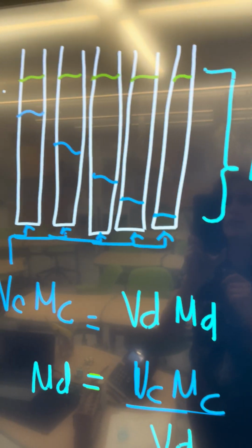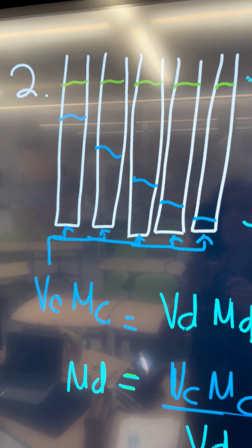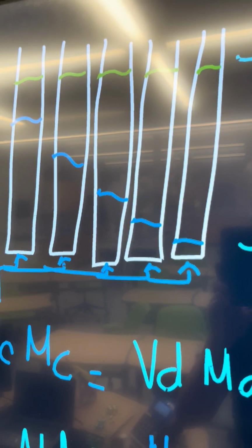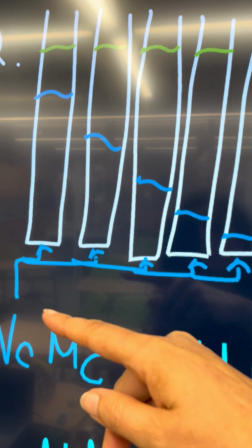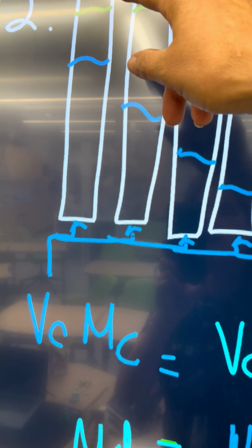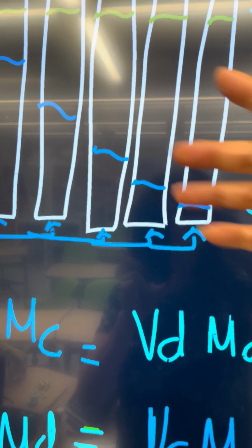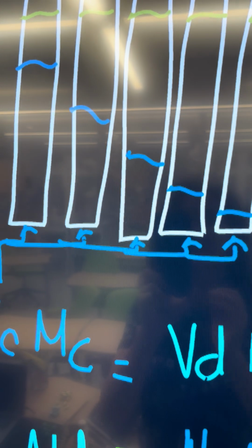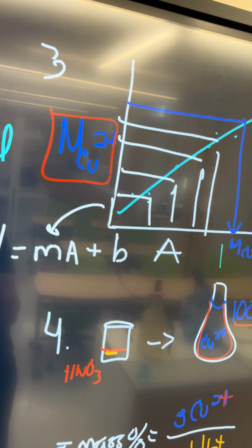So in order to find different molarities, what you did is you grabbed your 0.1 molar and you diluted it. 5, 6 different aliquots, you put them in test tubes. The first one we put 9 milliliters of concentrate, then water, and then we put a few other different volumes of concentrate. Now these are different molarities that I can use in order to make my graph.